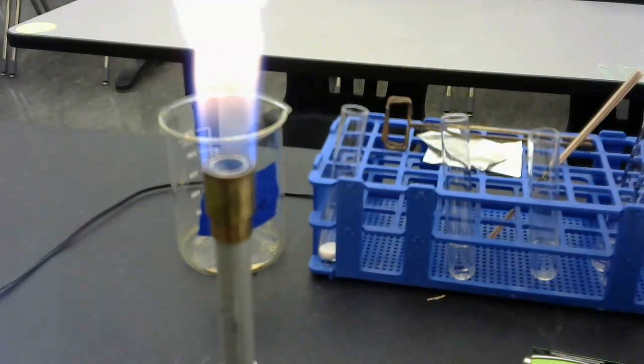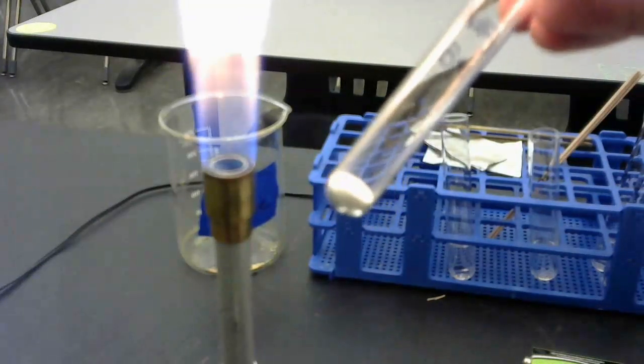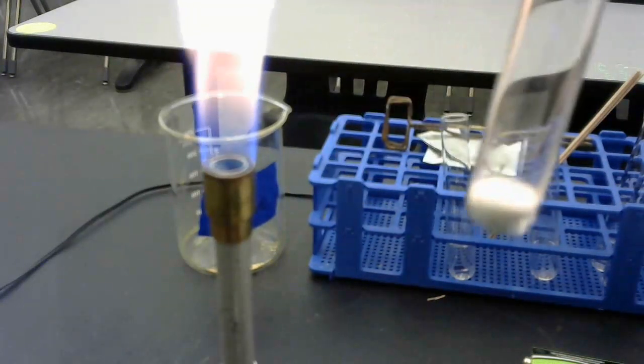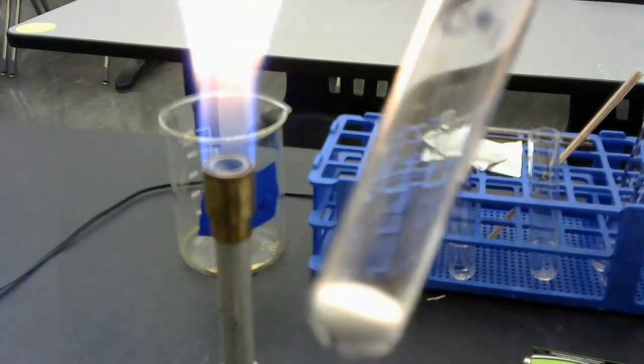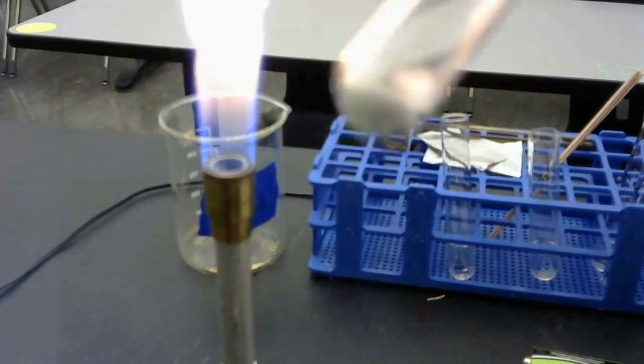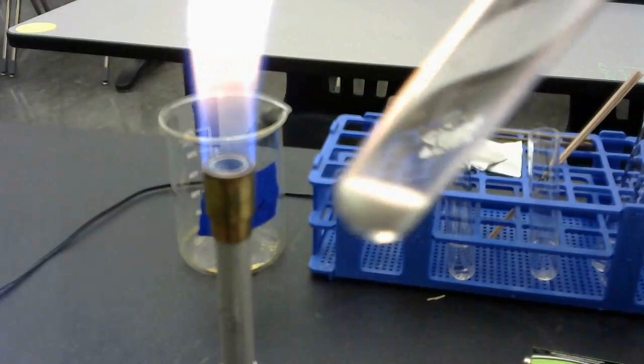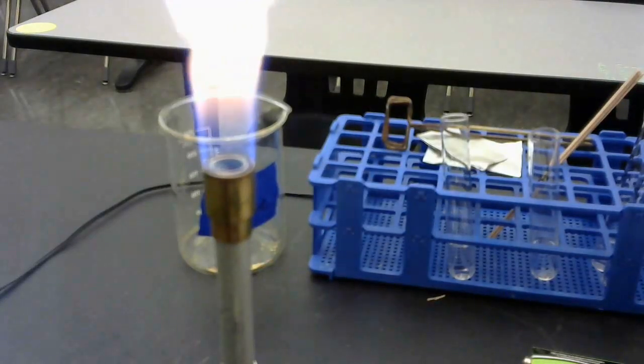It says place a very small scoopful of solid sodium hydrogen carbonate, which is sodium bicarbonate, which is the same as baking soda. That's actually already in your very first test tube to the left. It's labeled NaHCO3, for reaction B number 1. It's a white powdery substance. If you've ever looked at baking soda before, go into your kitchen and observe baking soda. It says find the mass of the test tube with the powder.